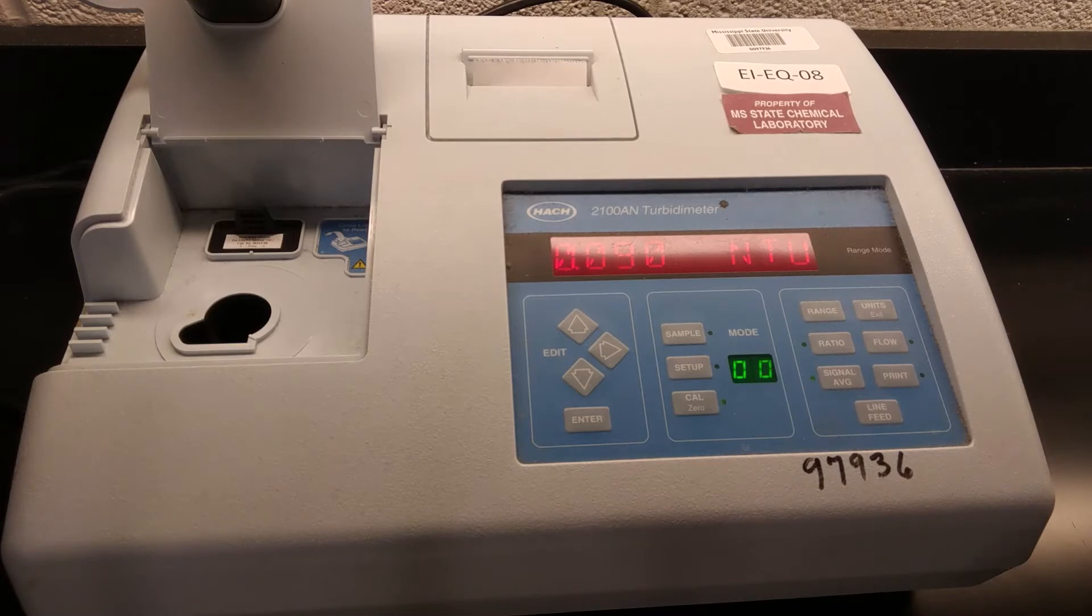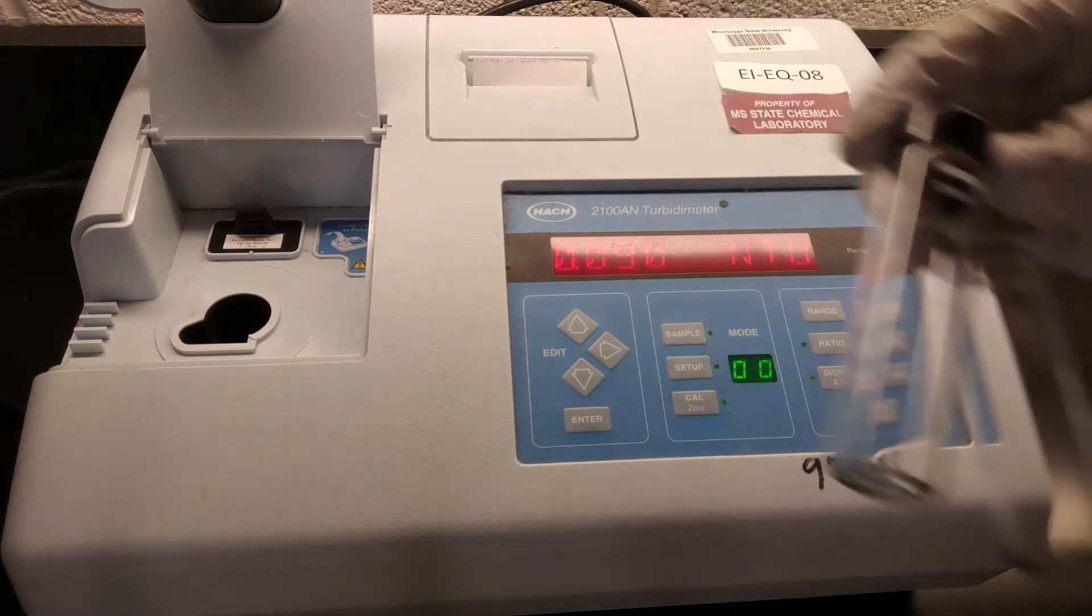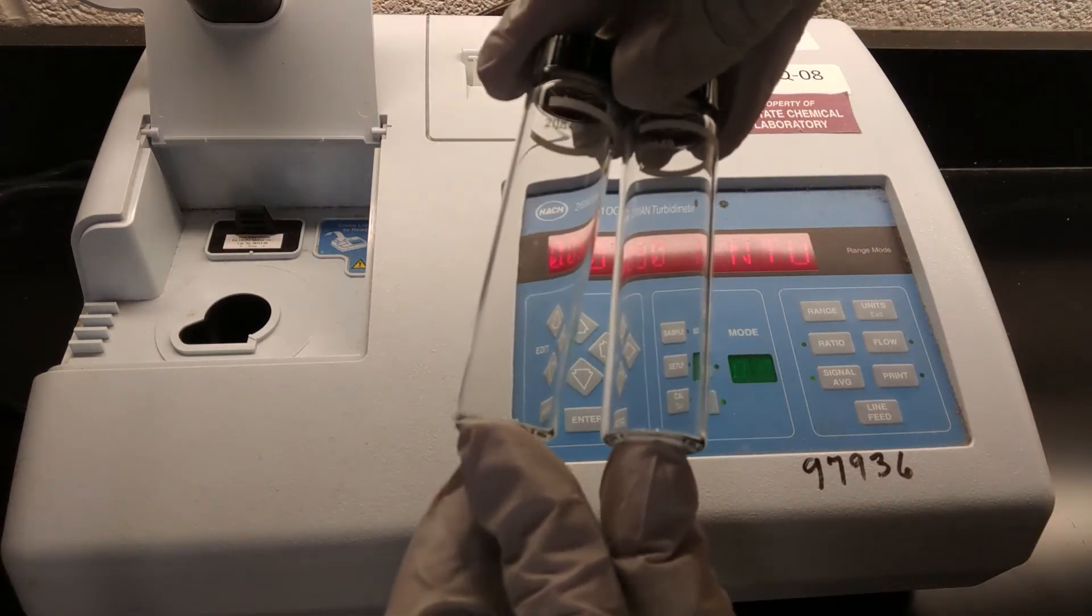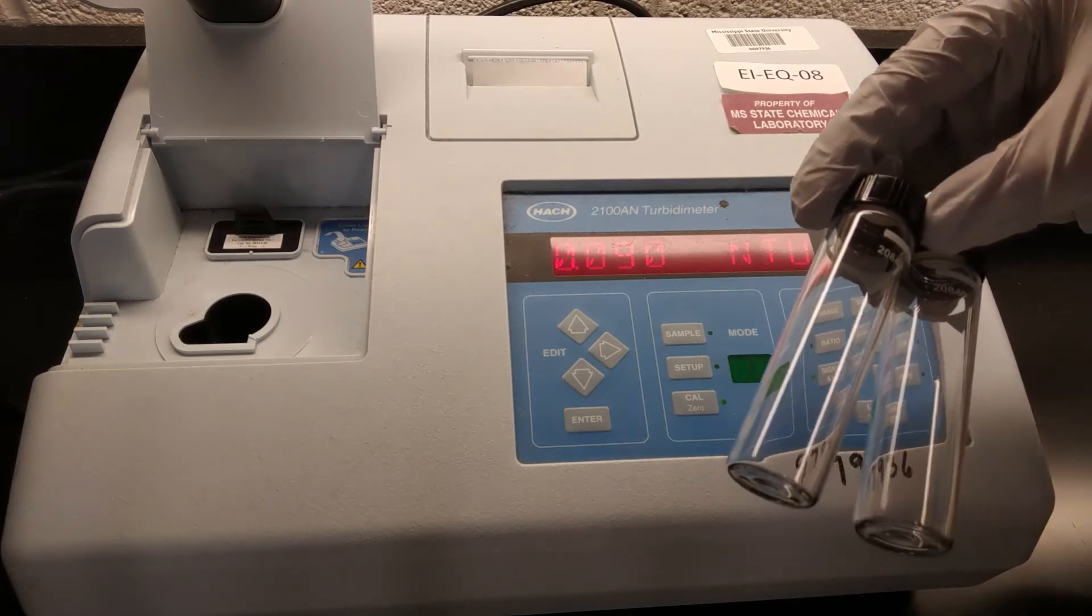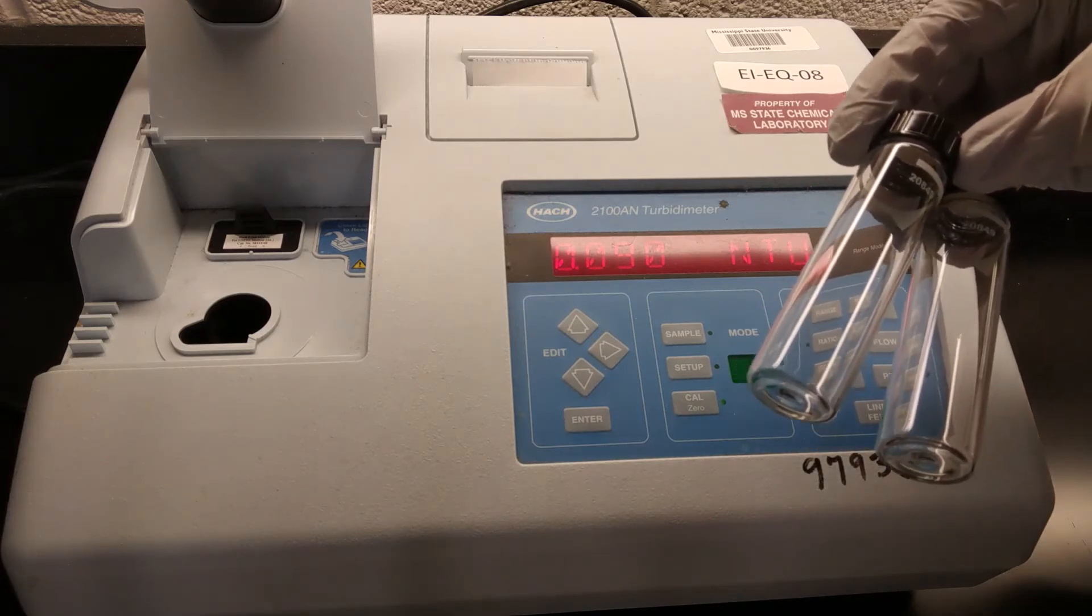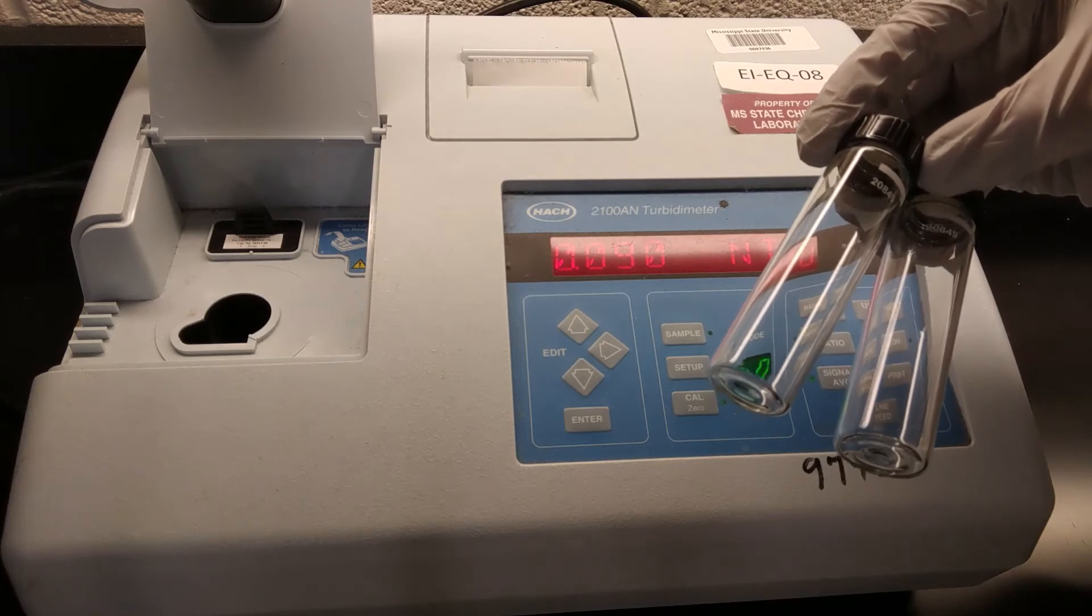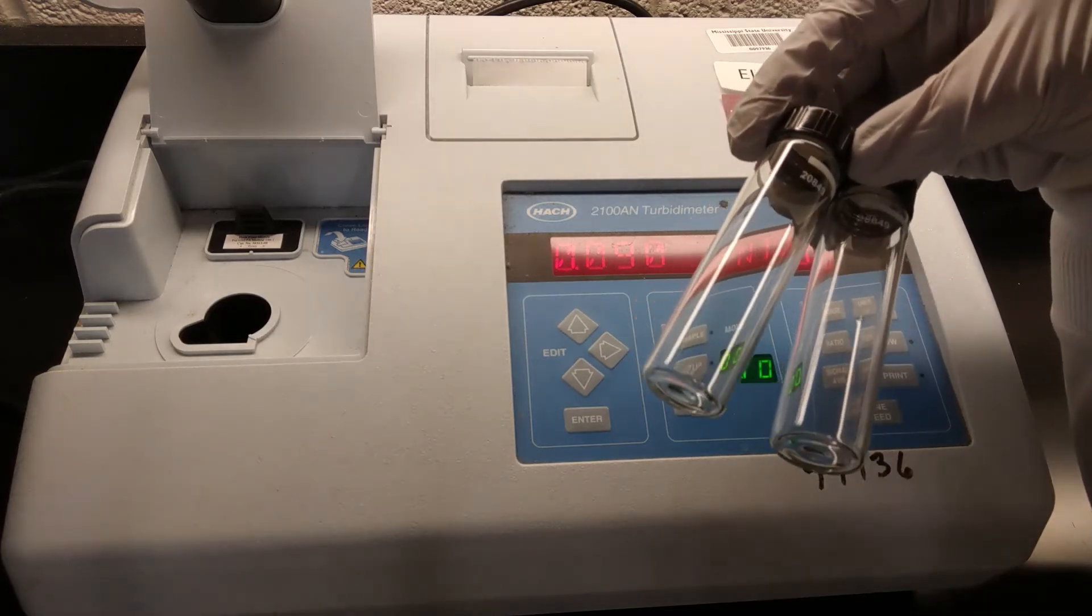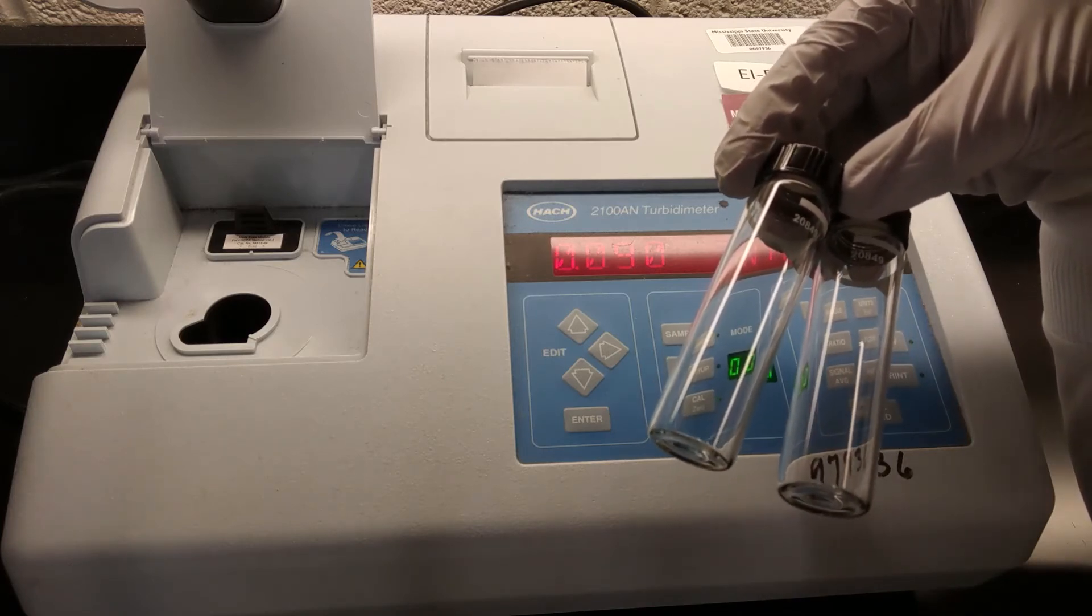So now we are ready to do our analysis and take some measurements. Before we do that, we are going to put our sample and a blank into some of these cells. You might be able to tell, but on these cells there are numbers 20849 and it's the same on both of them. What that means is that these are matched cells. And so they should have similar, if not identical optical properties so that we can accurately compare two different samples to each other knowing that the glass itself is not going to interfere with that comparison.